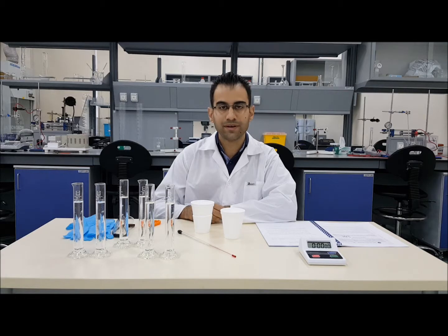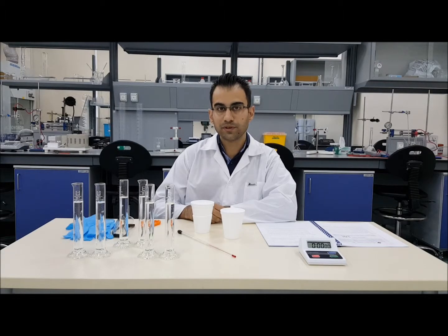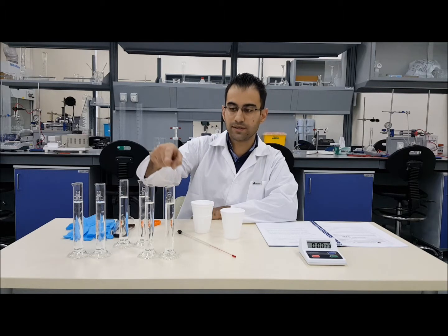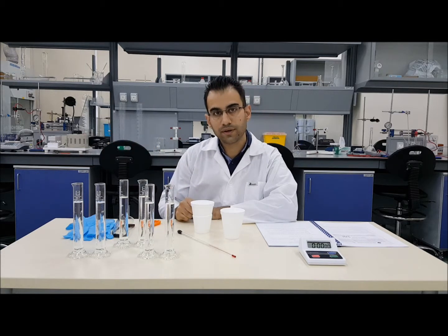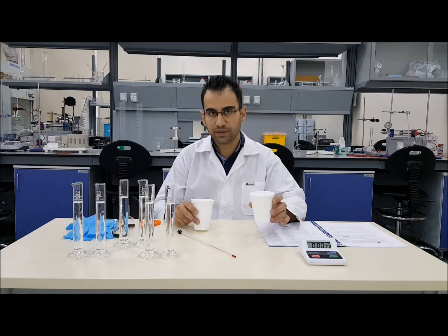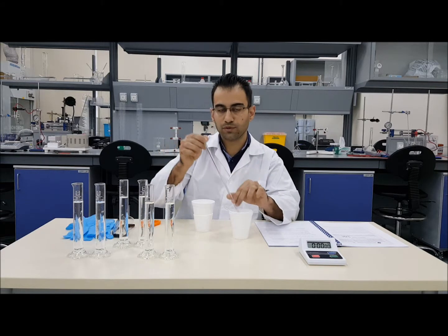Hello and welcome. This video will cover the thermochemistry and Hess's law experiment. For this experiment, you will be doing 3 trials, each trial with acid and base. We are using 3 different mixtures every time. We are using this as a calorimeter to hold the mixture, and we are using a thermometer to measure the temperature.